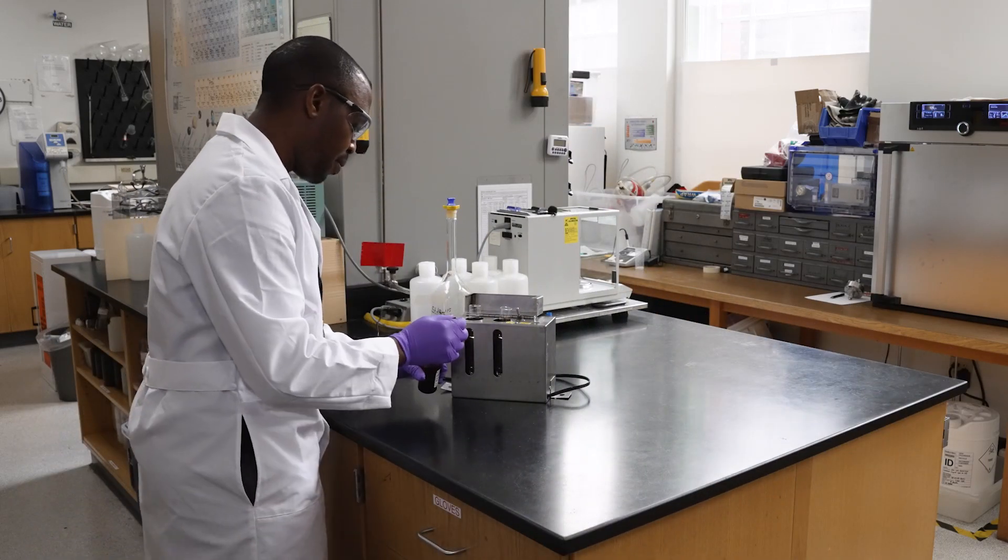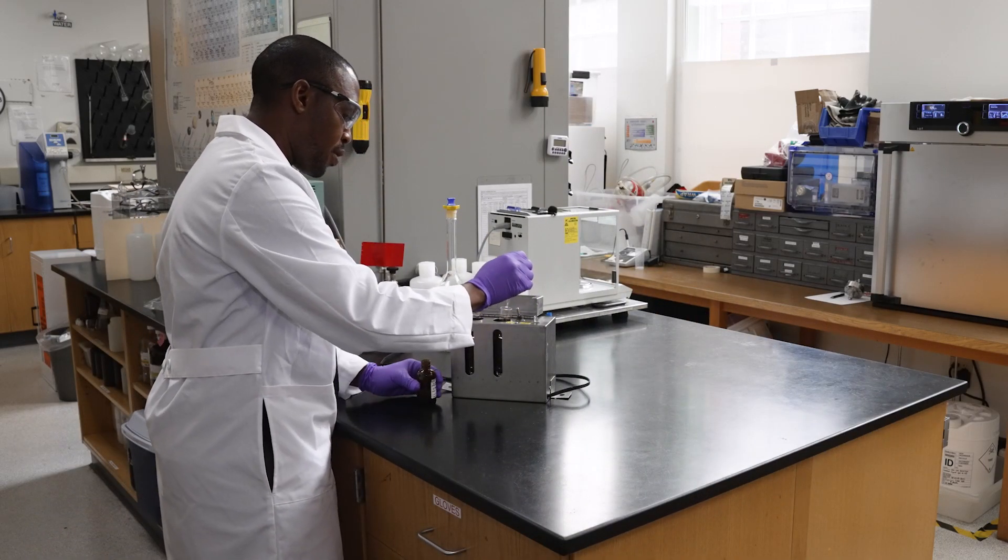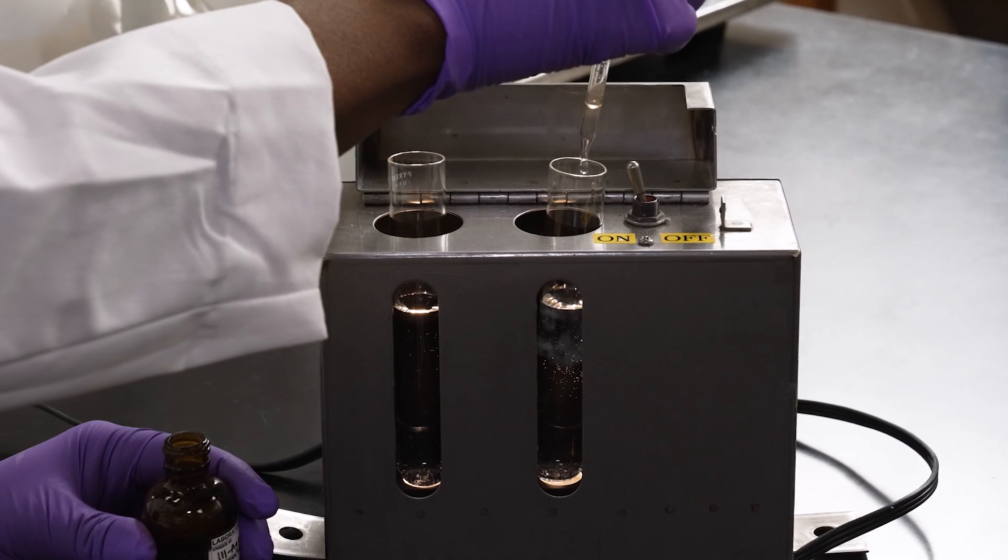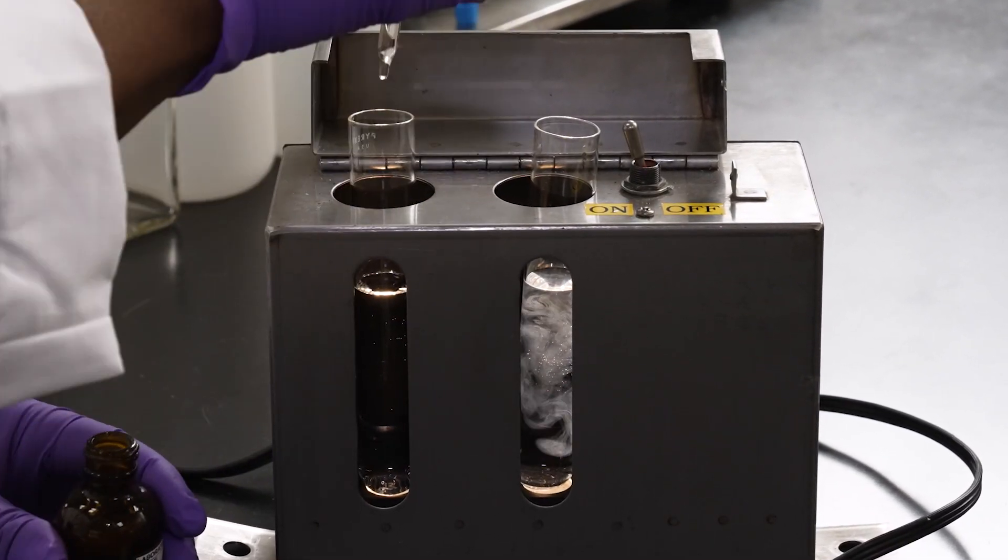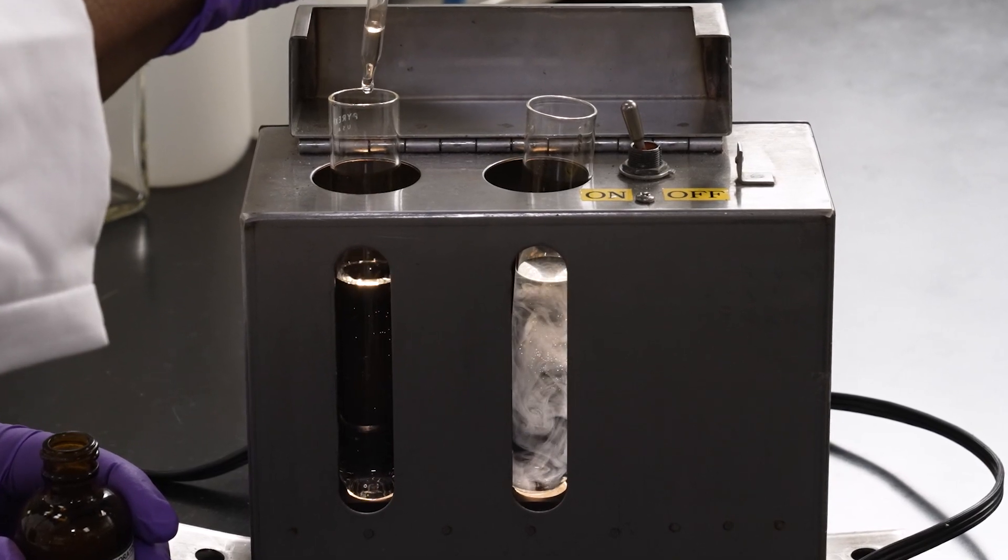Chloride is detrimental to metal surfaces, leading to corrosion and damage. In this quick test, if chloride is present, a white powder is formed, visible as cloudiness or turbidity.